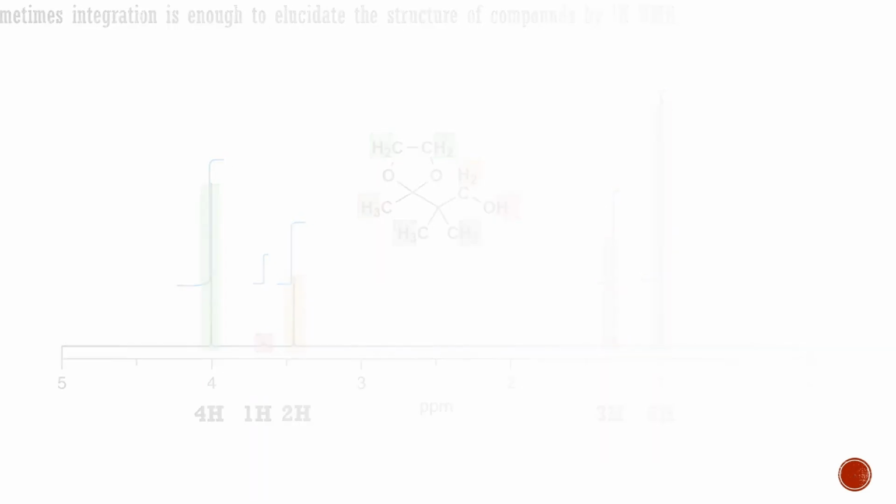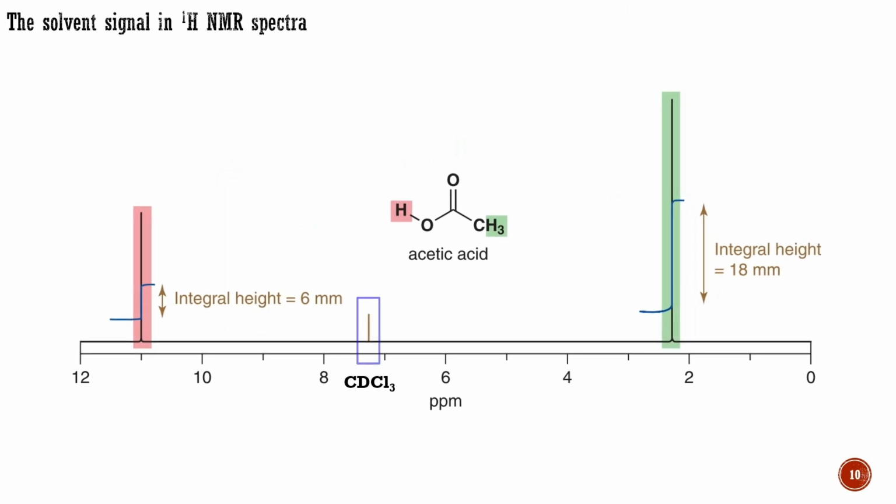Before we go on, a note about the solvent peaks shown in brown in these spectra. Proton NMR spectra are generally recorded in deuterated chloroform solution, abbreviated as CDCl3. Deuterated chloroform is a chloroform with the only proton replaced by deuterium. The proportionality of the size of the peak to the number of protons tells you why. If you ran a spectrum in normal chloroform, you would see a vast peak for all the solvent hydrogens because there would be much more solvent than the compound you wanted to look at. Using deuterated chloroform cuts out all extraneous protons. Deuterium atoms have different nuclear properties and so do not show up in the proton NMR spectrum.